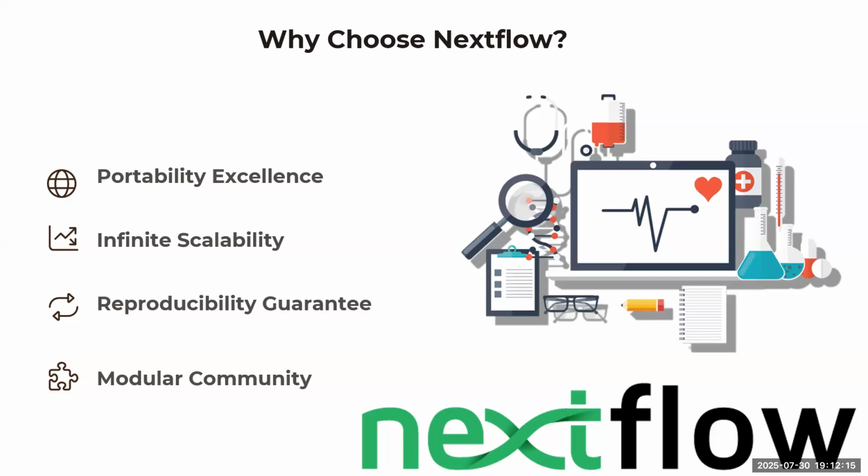It also has strong support for containers like Docker, and being able to run on Docker provides us with an environment that makes sure our tools are running in an isolated environment. Then reproducibility. Nextflow makes sure that reproducibility is guaranteed here. It helps to preserve the exact versions of the tools and the parameters, logs every run, and nicely organizes all the outputs that are there.